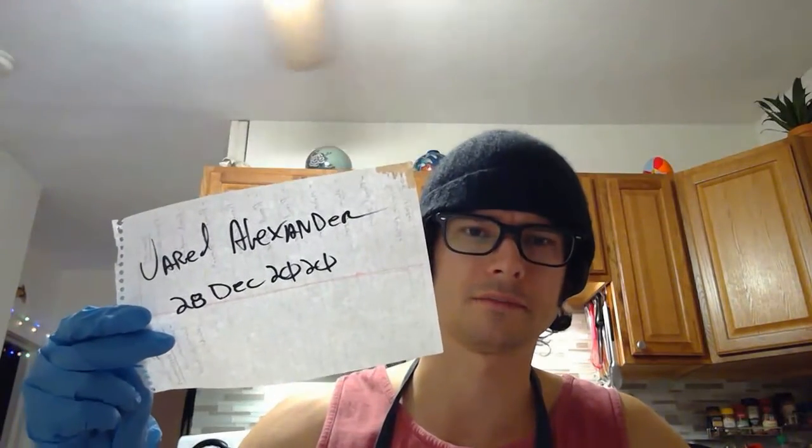Here's my name, today's date, and my notes, just a list of things that I need to identify as I go through this. So today, dissecting the sheep kidney. I'll throw on my goggles while I do this, and I will pause this video.